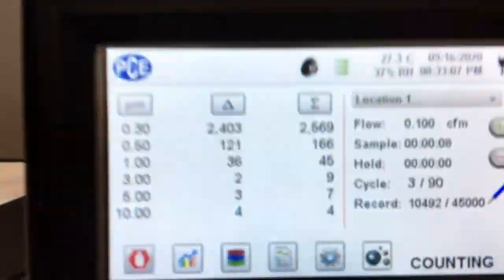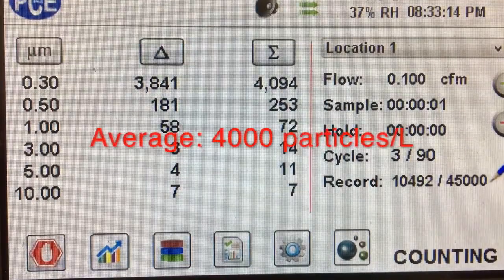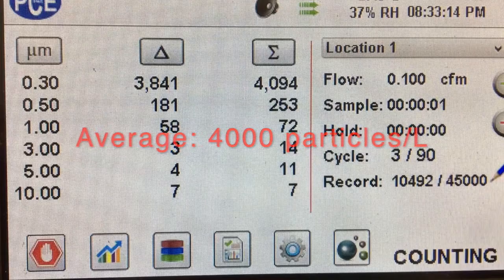And here's a video testing the ambient air. We did 90 trials and averaged around 4,000 particles per liter over those 90 trials.